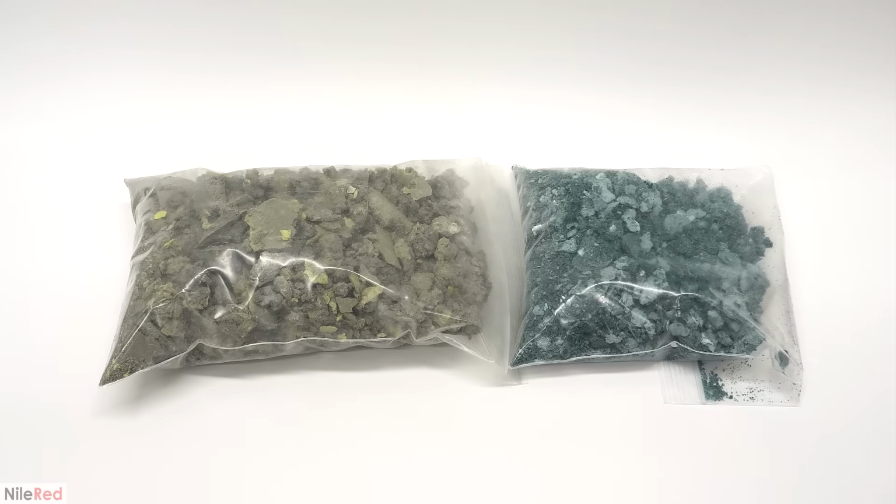In the end, I was left with these 2 bags of solid waste, which are honestly probably just non-toxic sodium and potassium salts. If I were to throw out a completely random estimate, I'd say that it's probably less than 10% chromium. But anyway, I of course don't have any real use for this, so I just put it all into my waste drawer, and that was basically it.